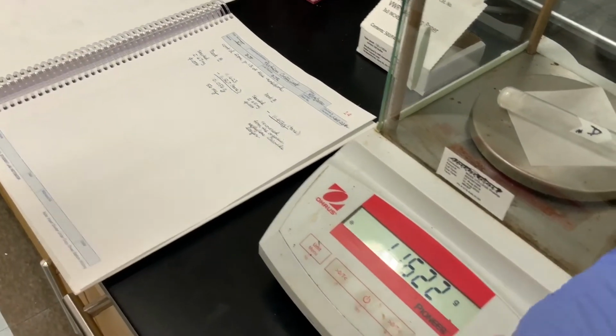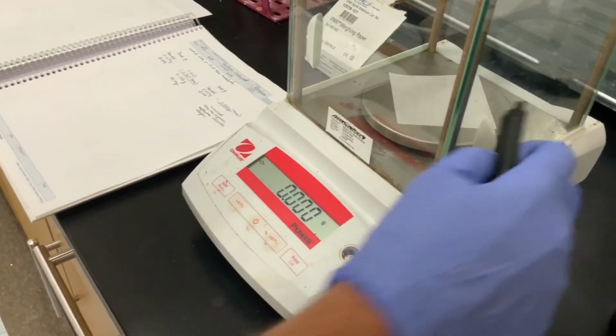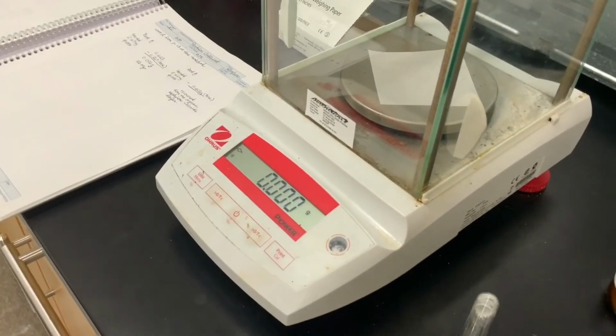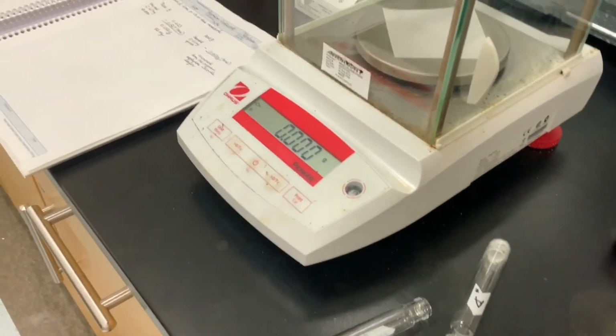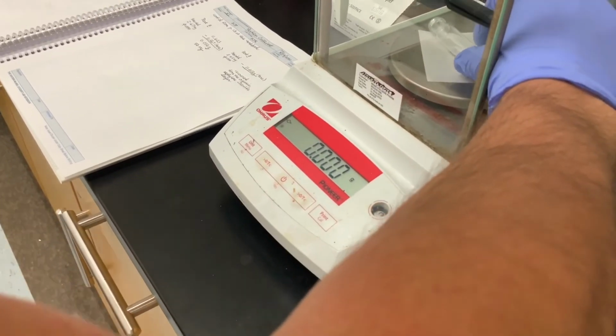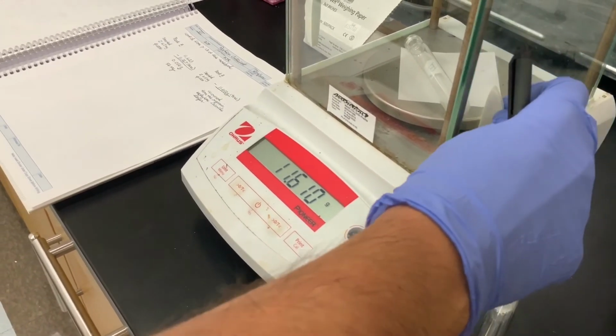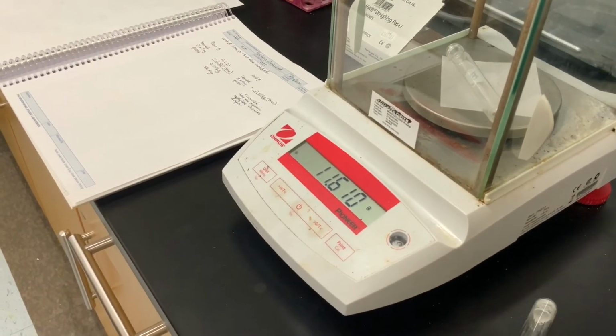Now let's get the mass of the amount of solid in culture tube B, where we started with 65 milligrams of benzoic acid. Let the balance settle.